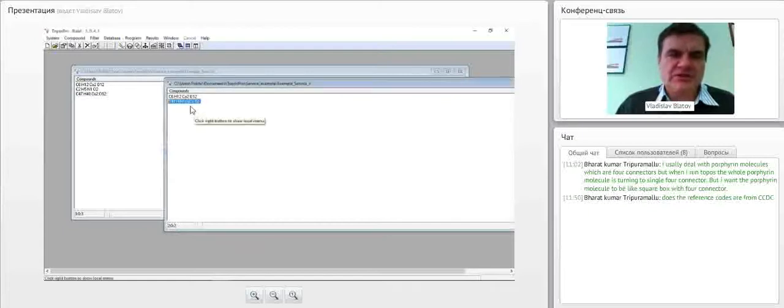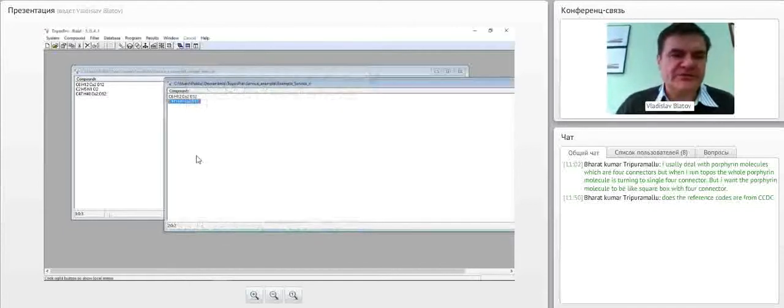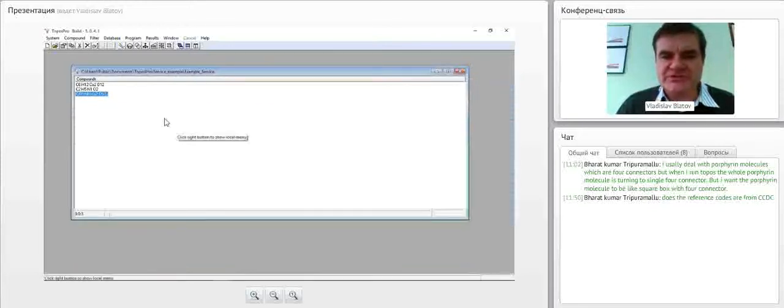And let's get immediately the second representation, the so-called cluster representation. I close this database with the simplified structures. I again open our ADS program, options, and I switch the simplification method from standard to cluster. Okay.